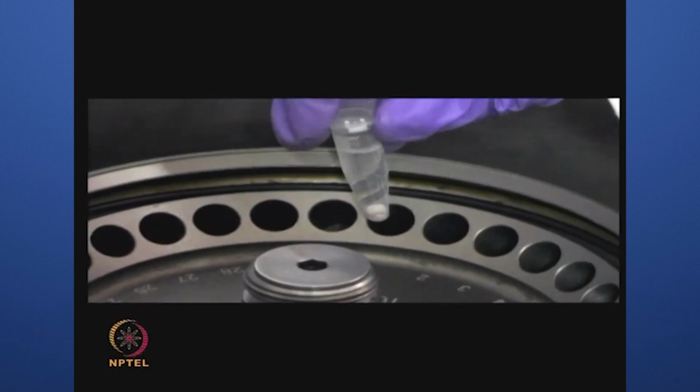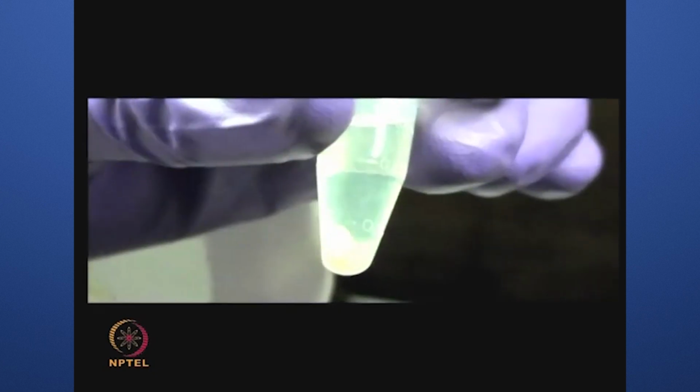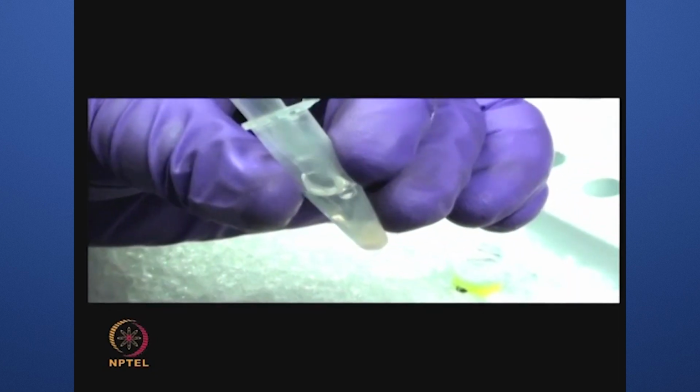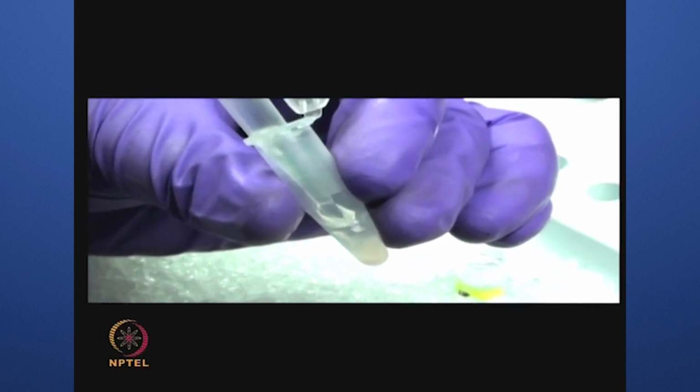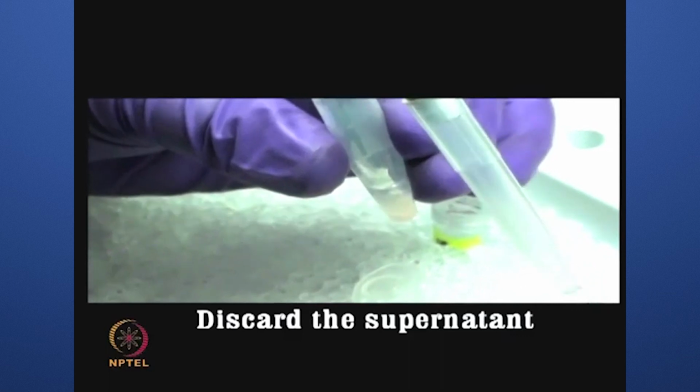Then remove the tube and centrifuge the contents to allow the proteins to settle down as a pellet. Carefully discard the supernatant and dry the pellet at room temperature.